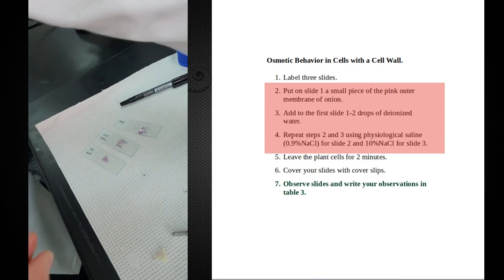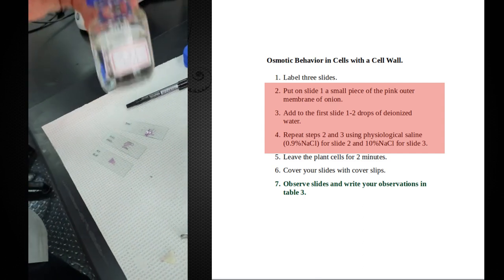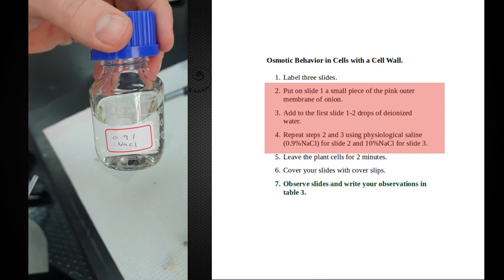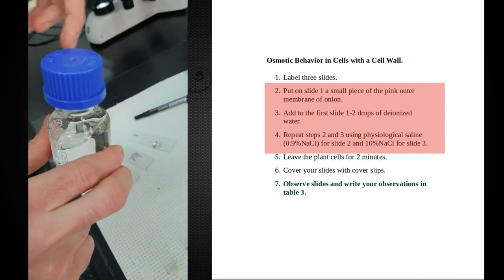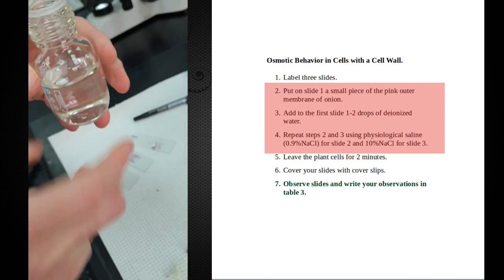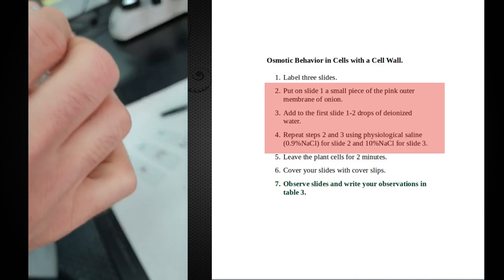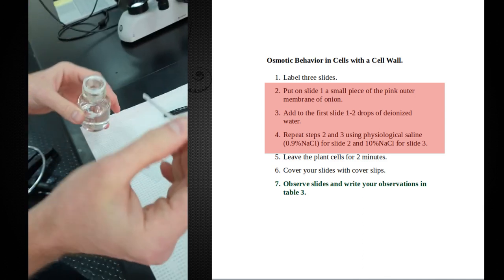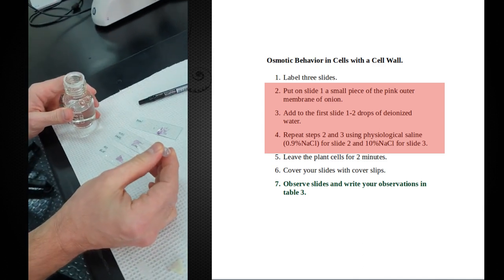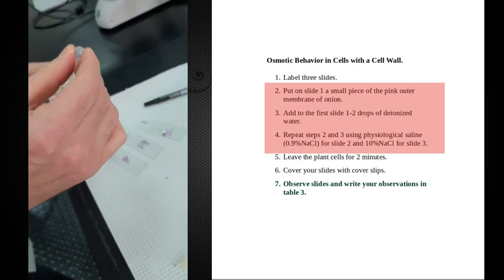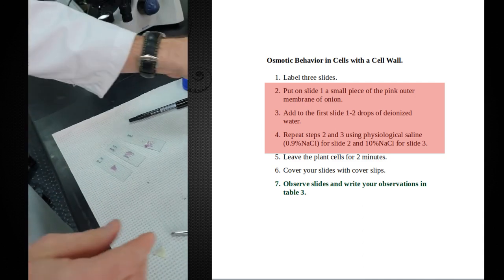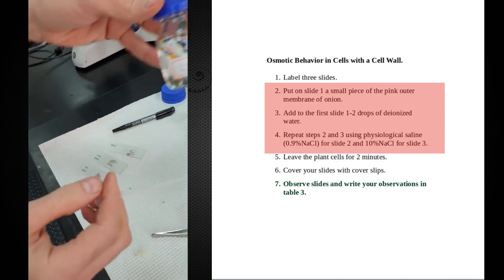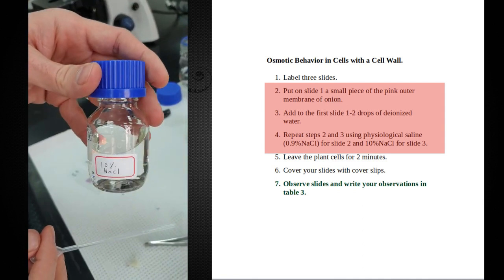And we're going to have 0.9% NaCl. The solution would be isotonic to your red blood cells, for example. So I'm going to put a drop onto my second slide here.